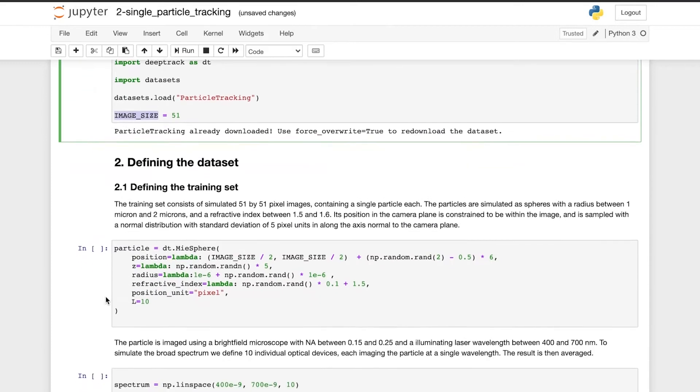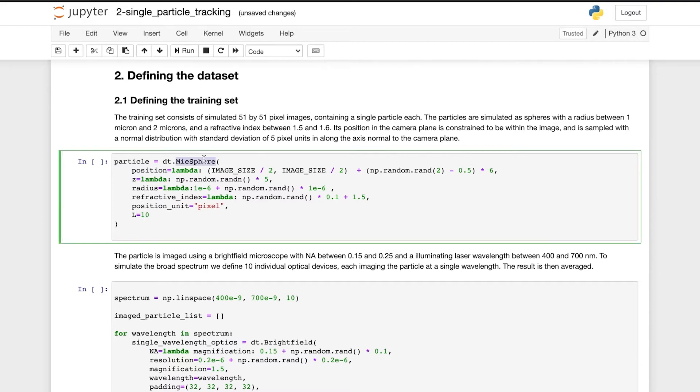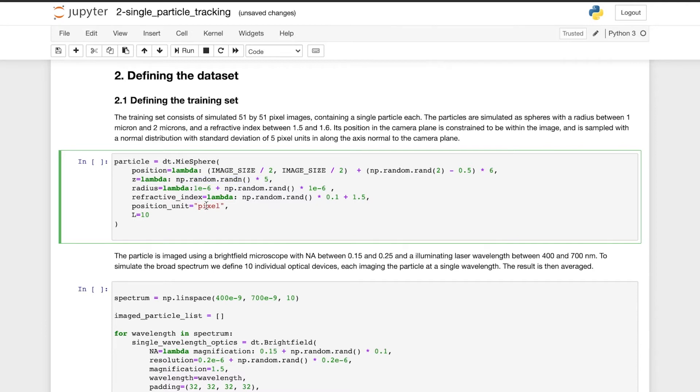Then, we define the data set. The training set consists of simulated images. The particles are simulated as spheres and the particle position is set close to the center of the image with some variation in x and y, as well as in the z direction. These values are based on pixel units. The particle radius is set between 1 and 2 microns and the refractive index between 1.5 and 1.6. And L is the number of terms to evaluate the Mie theory.